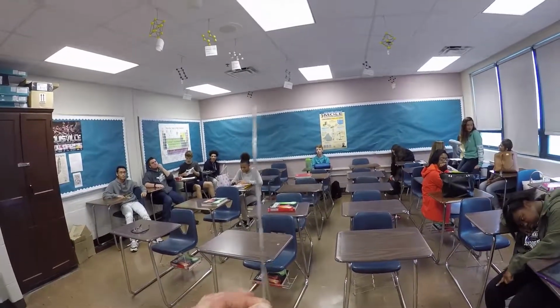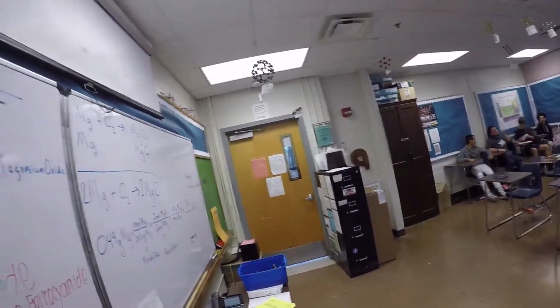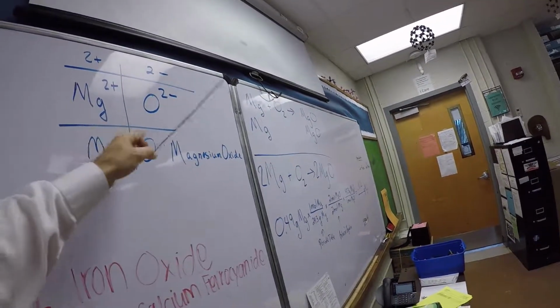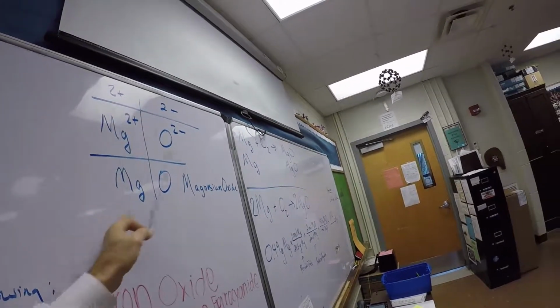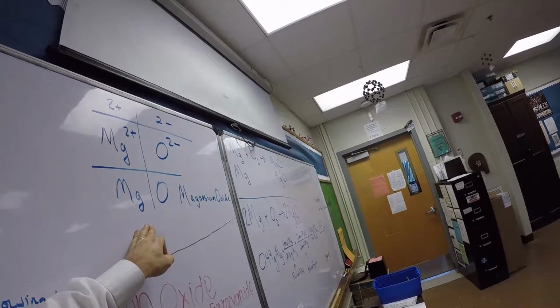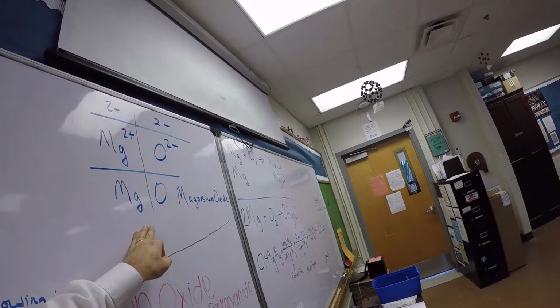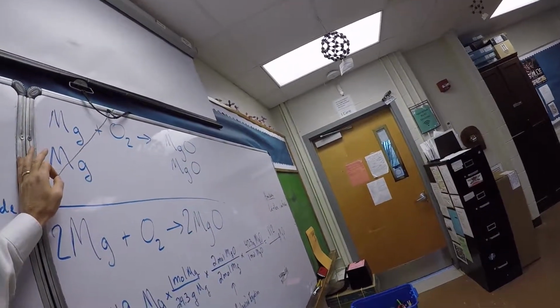So up here, we've got some magnesium. Now we're going to add fire to it to make it an ion. And then we're going to react it with oxygen. Now based on the charges, we're going to form MgO. So you're going to make this MgO powder today. We call it an ash, not a powder. Ash, it's a powder.